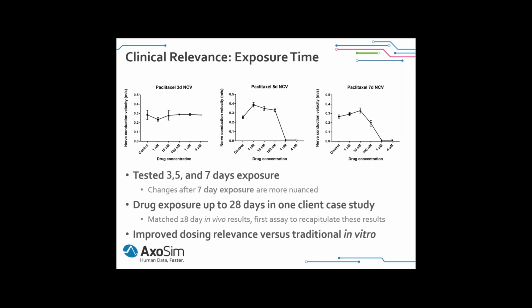So this really shows you one of the knocks on in vitro is the exposure time isn't in vivo or clinically relevant. And we're building on that to try to get towards better relevance.